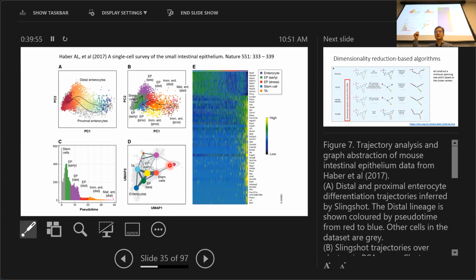But as I said, for the highly variable genes, this analysis does not capture the information of increased variability of some genes in a subset of cells. Your average sometimes may reflect this change of variability, but not always. Okay.